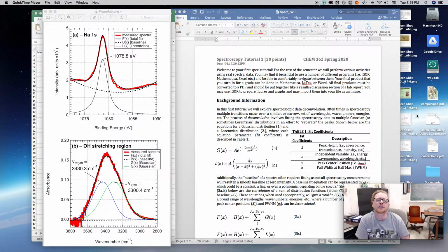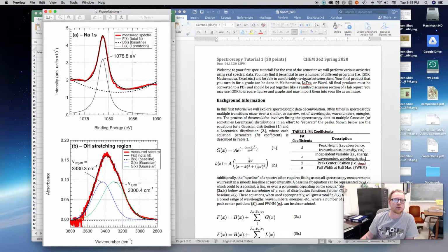Folks, so this is a supplemental video lecture I'm recording for you for your first spectroscopy tutorial, Spec 1. So in this tutorial, what you're going to be working on is deconvolution, spectroscopic deconvolution.